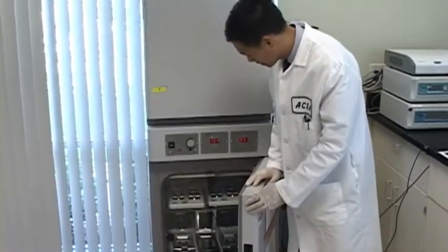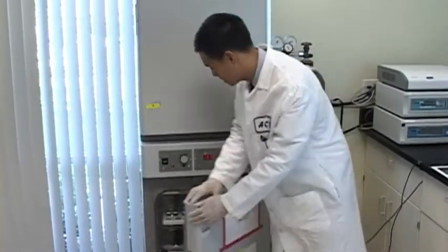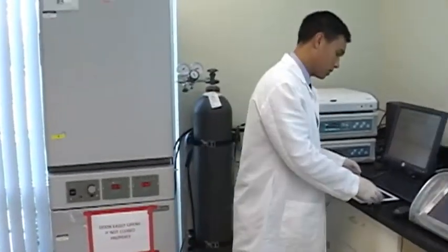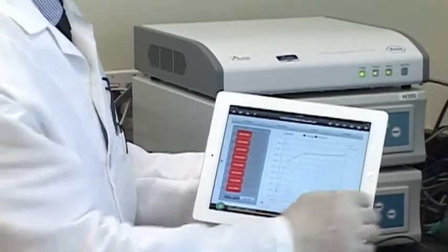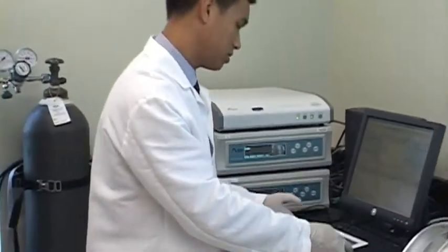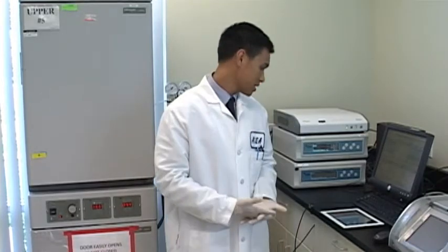So now the plate is in and engaged as indicated by the green light, and we are ready to immediately start recording our assay. So here on the software, we just press play and we're good to go. And here, as I mentioned earlier, it'll initially start to read at 2 hours at 1 minute intervals for your short-term response from your compounds, as well as 96 hours at 1 minute intervals for the long-term effect from your compounds. And from this stage on, after clicking play, you're ready to walk away and let your data acquire and generate. And so that's the receptor signaling assay.